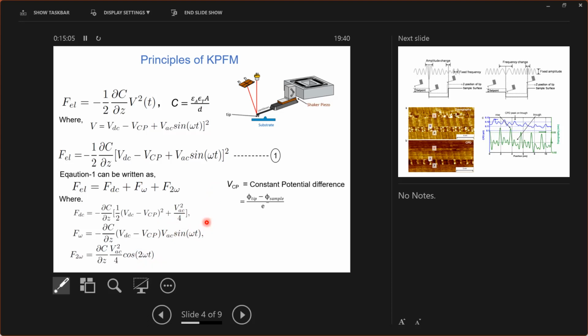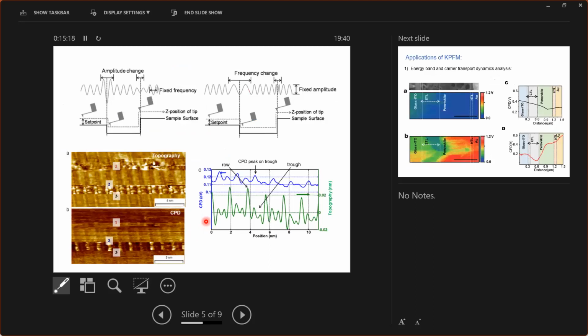Yes. You can measure surface potential, which AFM can't. How did they measure for solar cell? Because it is layer by layer, how did they measure that from ETL to HTL? Yeah. Like they put it like this.